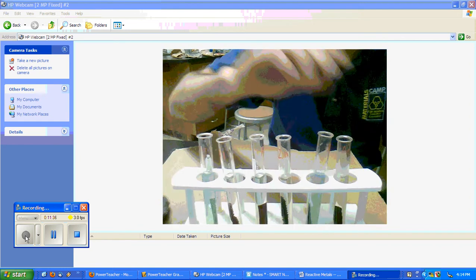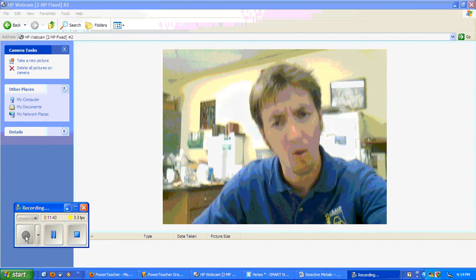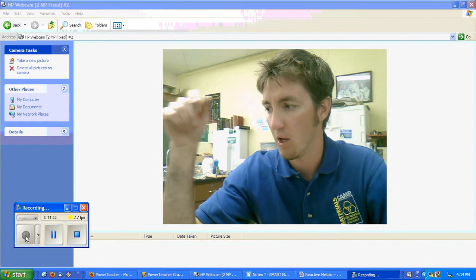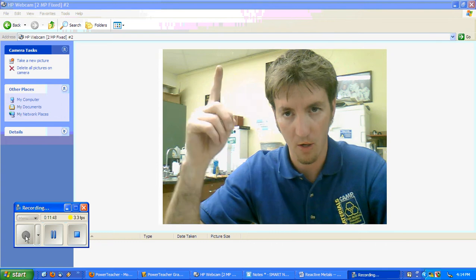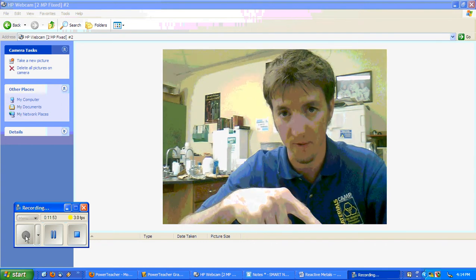Okay, so finish the worksheet, analyze these things. Oh wait, what about copper, you ask? Because that was one of the things you have to rank. So where's the copper? We have all these other metals. Copper is in the copper sulfate, so copper is in every single one of these.